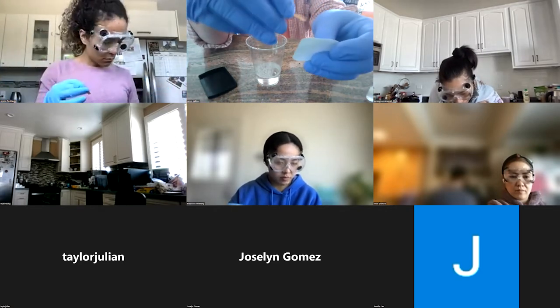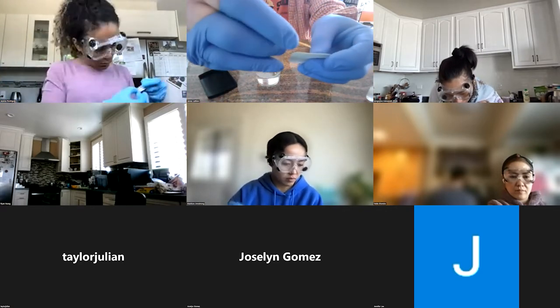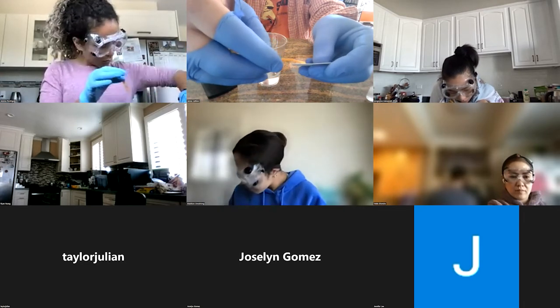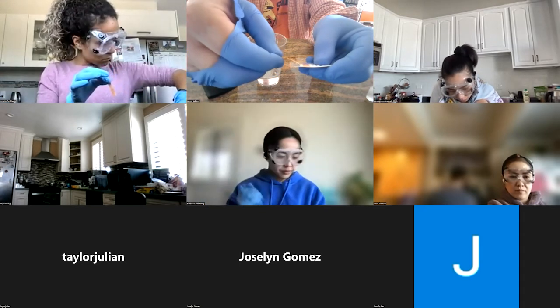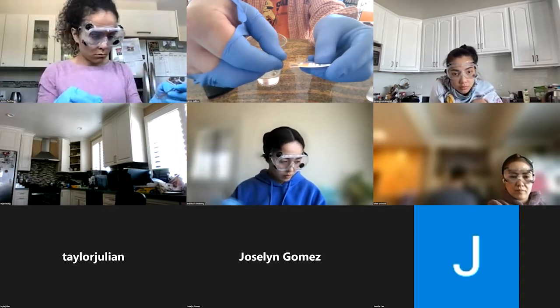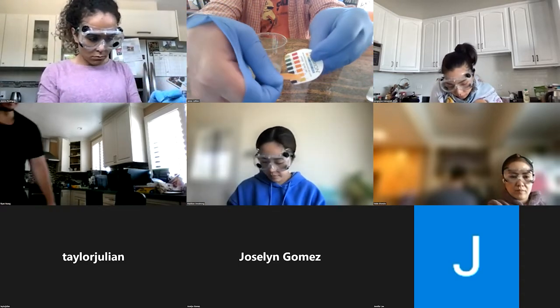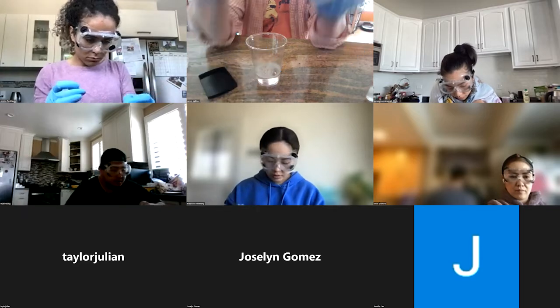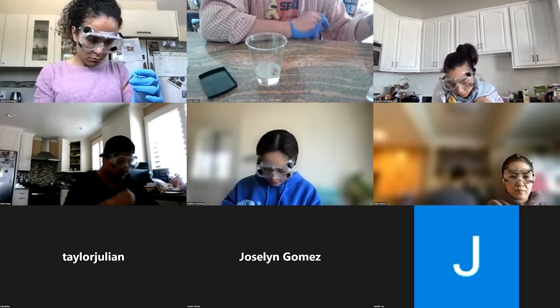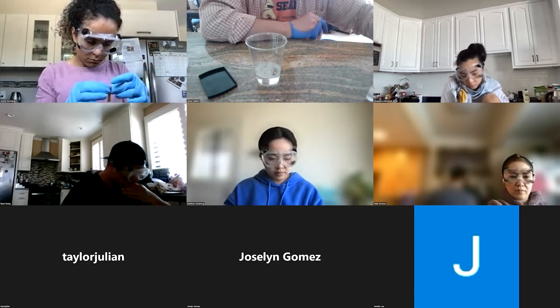So it's a little more acidic than I would expect. Most soaps are more alkaline. But yeah, this looks right between 6 and 7. The homemade stuff should be a lot more basic than that.